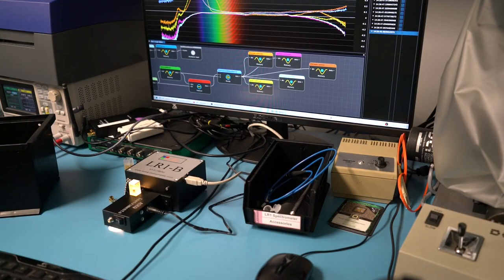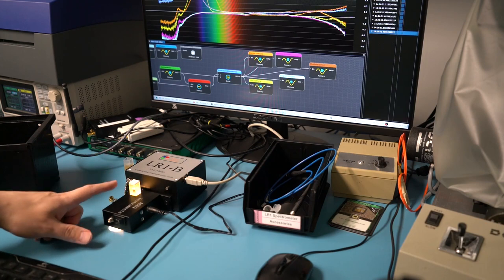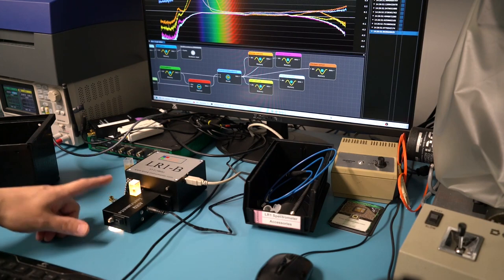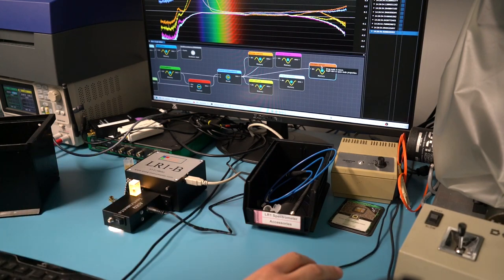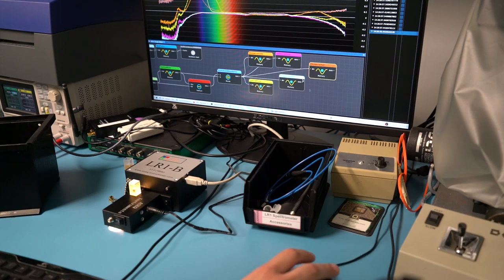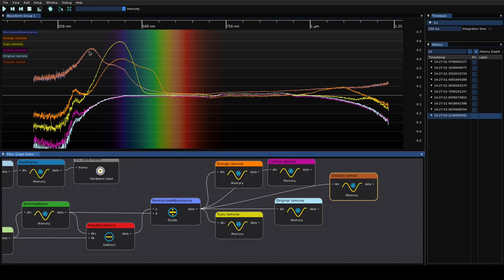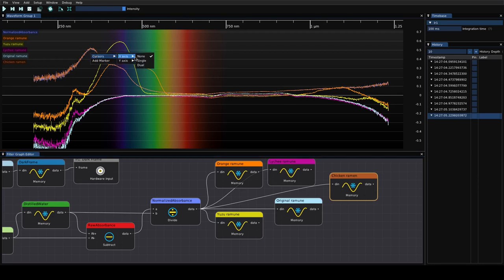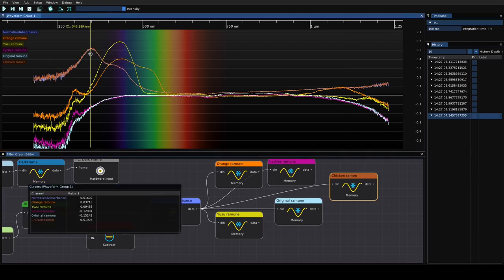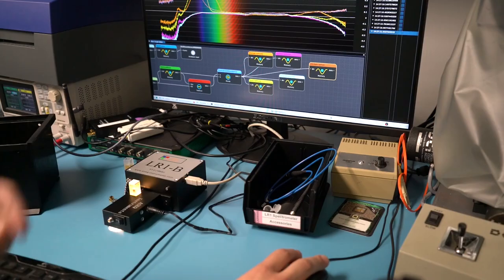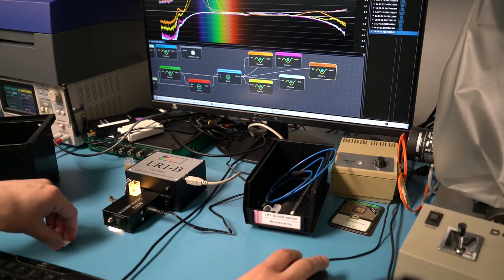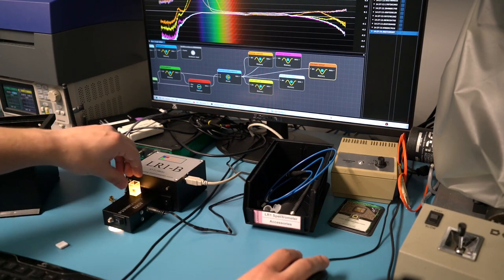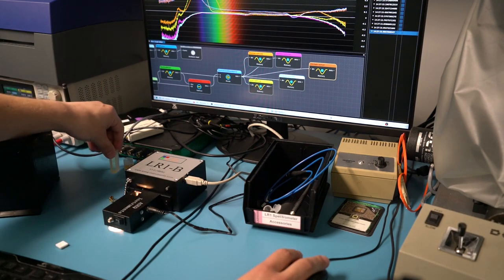Here we are back in the lab after a session in the kitchen. We've got some of the chicken ramen broth in here right now and I'm going to go grab a spectrum of that. Obviously it is very distinct from any of the Ramune. We've got a lot more absorbance in especially the UV right here. We've got this huge peak around 350 nanometers for the chicken.